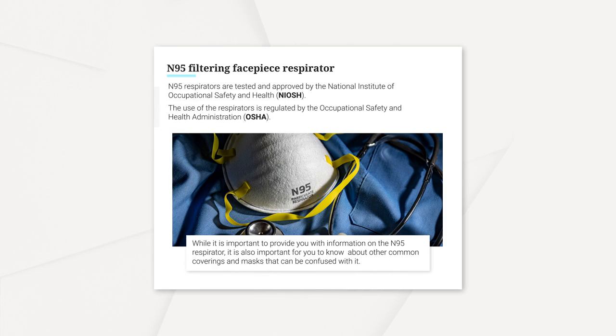N95 respirators are tested and approved by the National Institute of Occupational Safety and Health, NIOSH. The use of respirators is regulated by the Occupational Safety and Health Administration, OSHA. While it is important to provide you with information on the N95 respirator, it is also important for you to know about other common masks that can be confused with it.